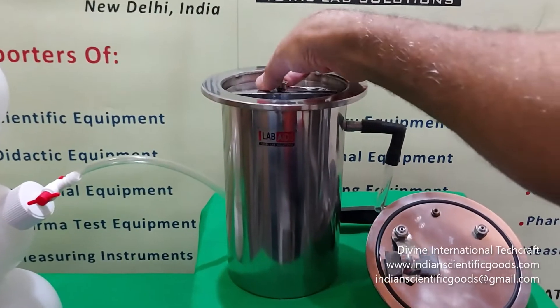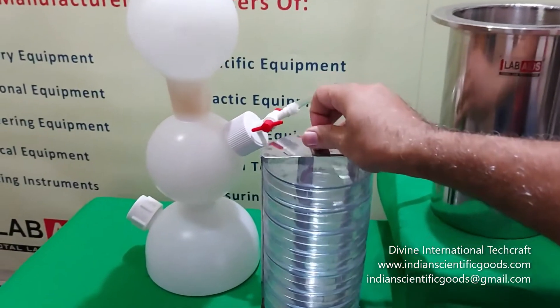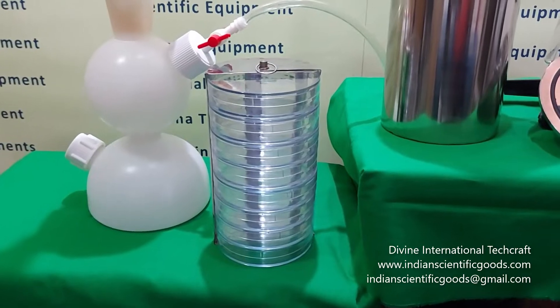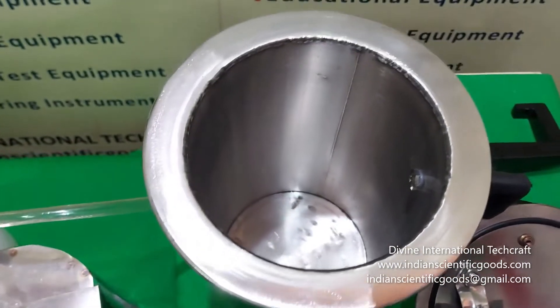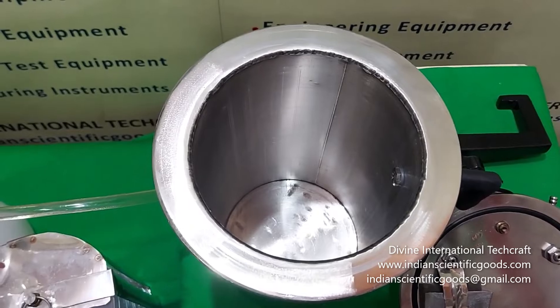A stainless steel rack is provided inside the jar. This stainless steel rack can hold up to 8 culture dishes of size 100 mm diameter into 20 mm depth. The anaerobic jar has an internal depth of 22 cm and an internal diameter of 12.5 cm.